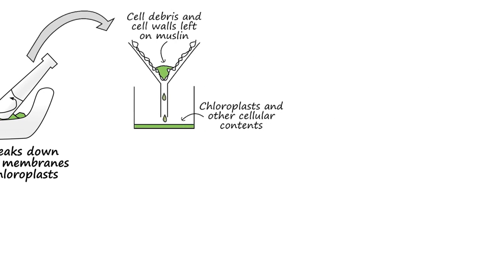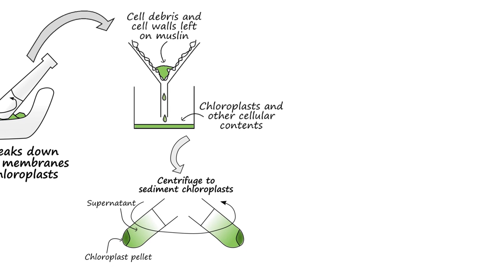Once we've ground it, we'll then filter out the cell wall debris using some muslin and then centrifuge the extract at 3,000 revolutions per minute for five minutes. Centripetal forces mean that the denser components of the cell, including the chloroplasts, will collect in a pellet at the bottom of the centrifuge tube. After centrifuging, we'll pour the supernatant away and re-suspend the pellet to get a nice chloroplast extract.